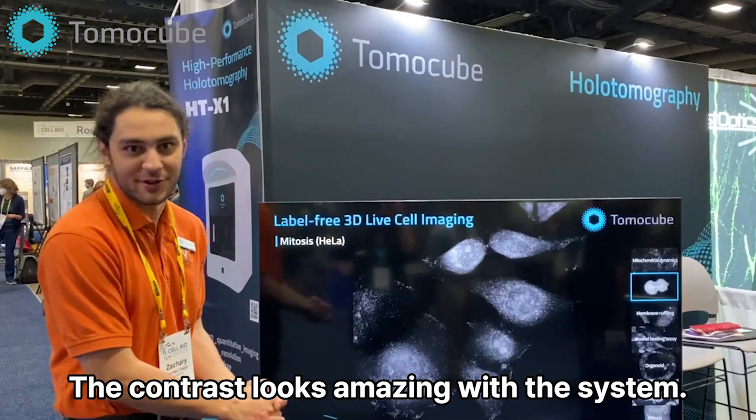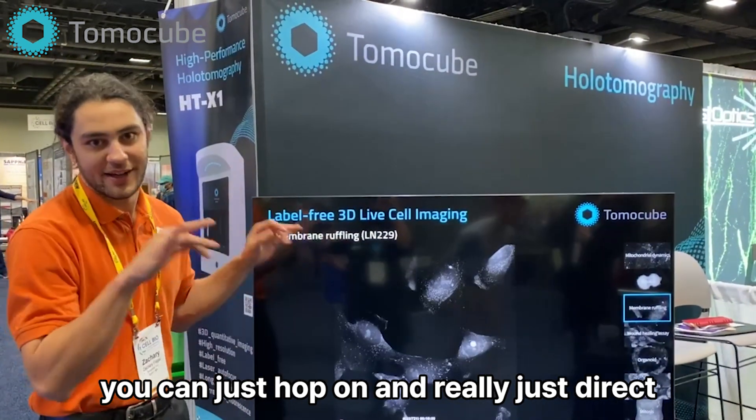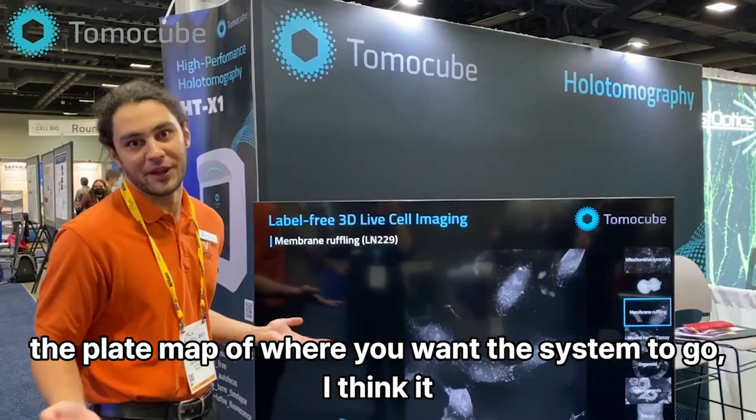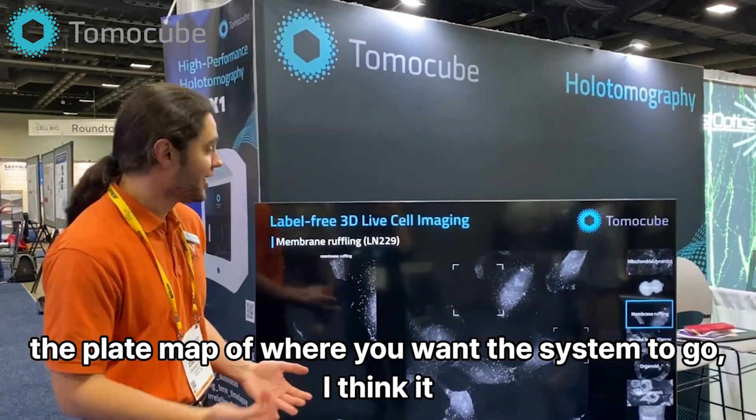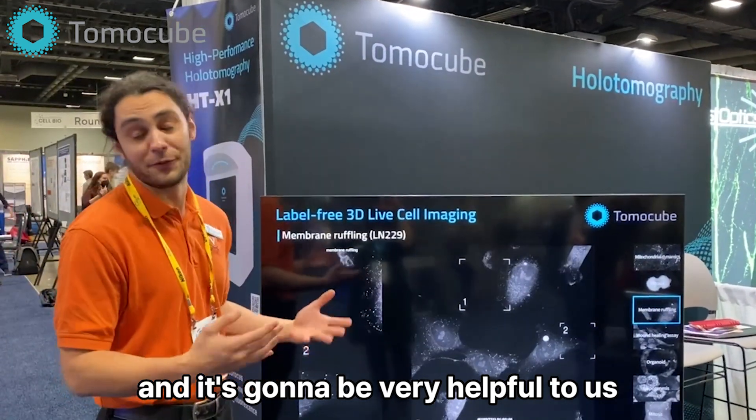The contrast looks amazing with the system. The fact that it's so easy to use — you can just hop on and really just direct the plate map of where you want the system to go. I think it's very user friendly and it's going to be very helpful to us in the long run.